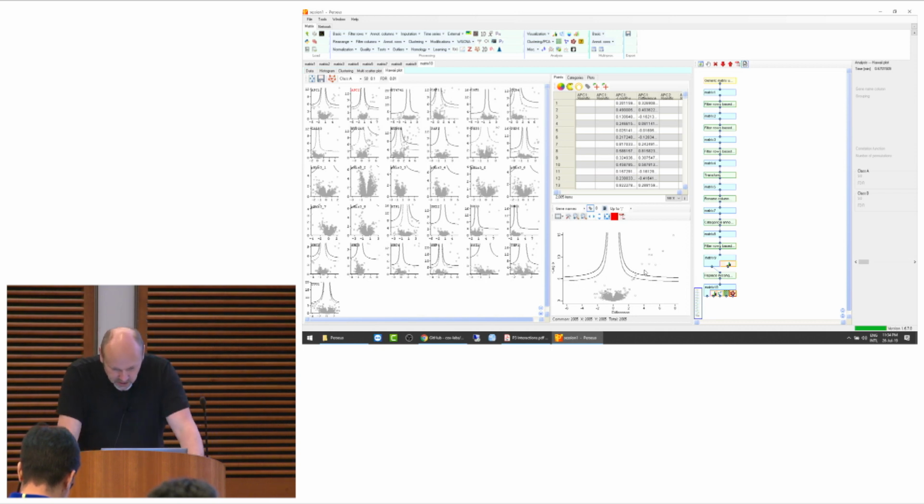So you can, for example, now, so this is for APC2. This would be the clear interactors of APC2. Then there's one in the twilight zone between 1 and 5% FDR. So that would be your class. So these would be your class A interactors. This would be the class B interactor. And so you can do lots of things here.